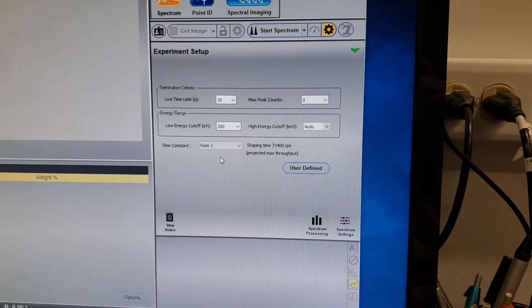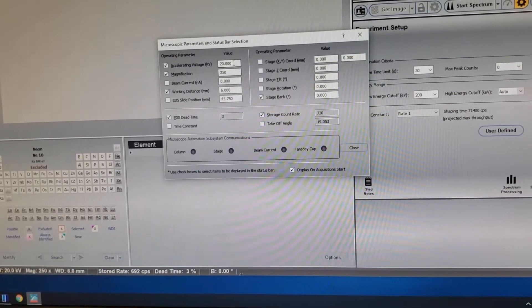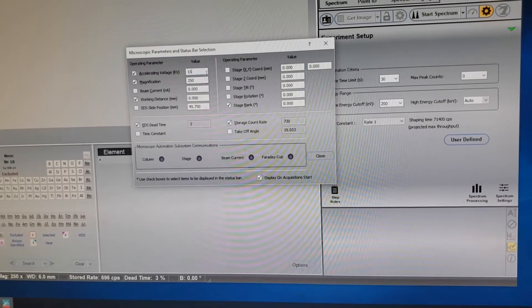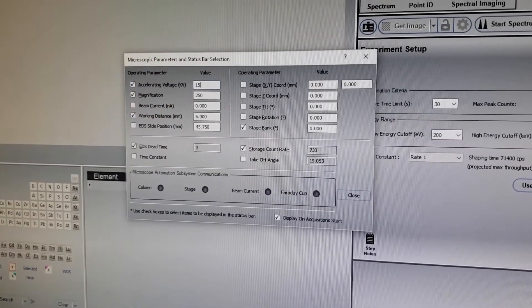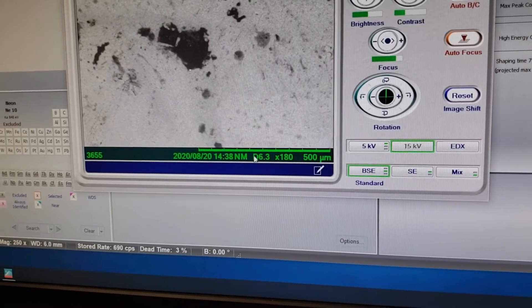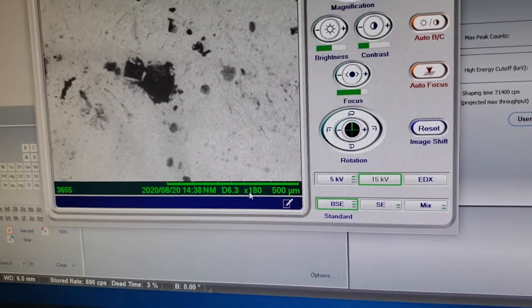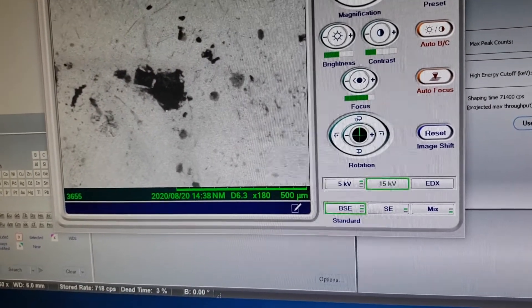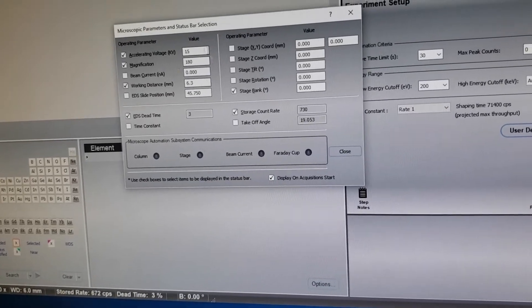Finally, set time constant to Rate 1. Once you have these set up, click Start Spectrum and it will prompt you to enter information: the accelerating voltage you're using. On our SEM, we can only use up to 15 kV. I also want to check our magnification and working distance by bringing up the imaging software. The 'd 6.3' shown here is our working distance — 6.3 mm between the detector and the surface — and 180x is our magnification.